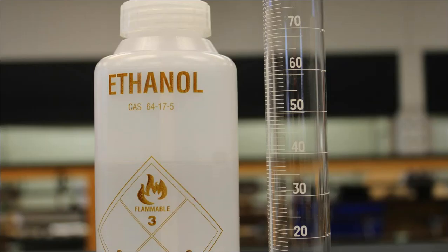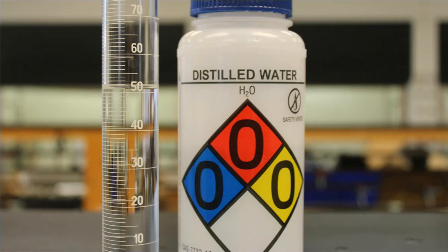So the lab directions are going to tell me take ethanol. Well, here's my ethanol. This is a stock solution of ethanol. And to take water, and this is the water as well. It's just DI water that we get from our lab. And it wants me to make a 50-50 mix. 50-50 mix means half-half. So 25 of one, 25 of another, 50 of one, 50 of another, 100 of one, 100 of another, 10 of one, 10 of another. That's what 50-50 mix means.